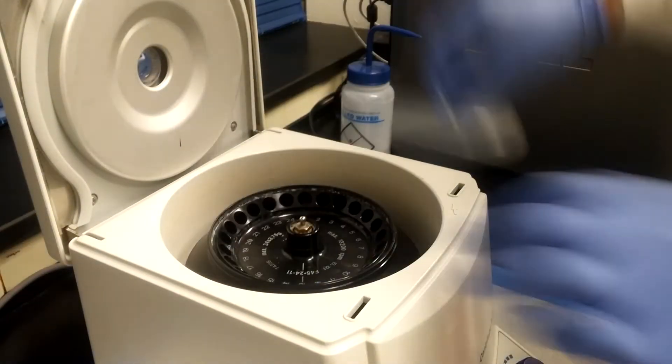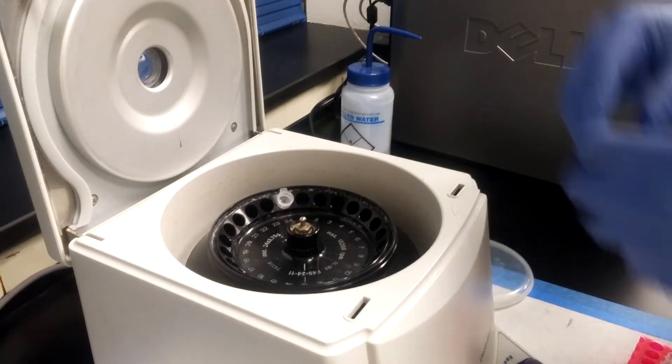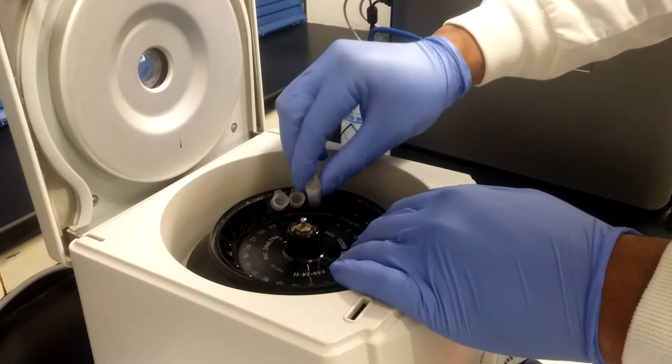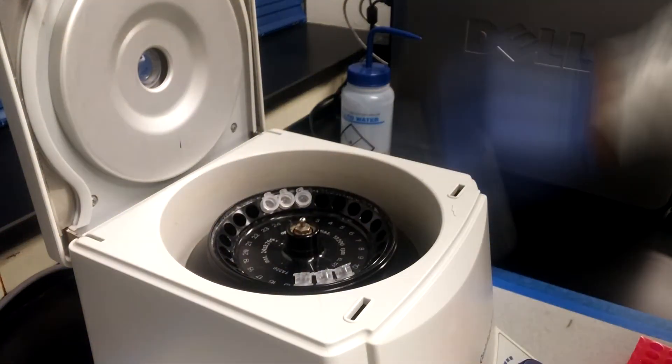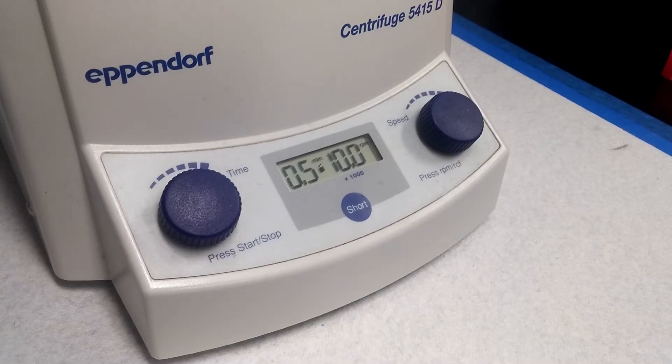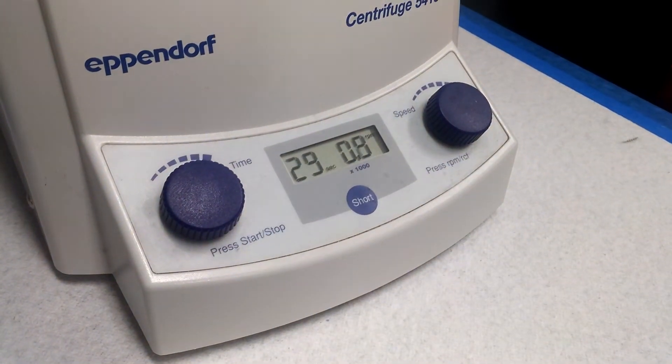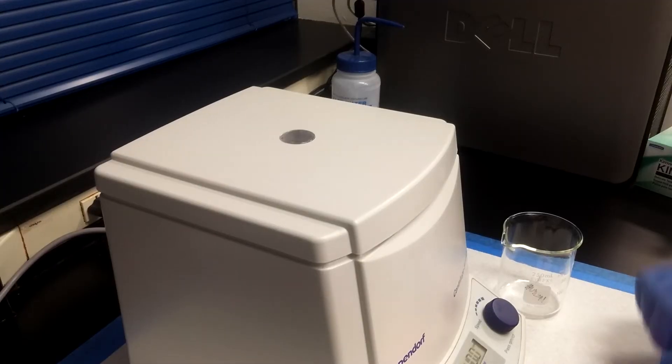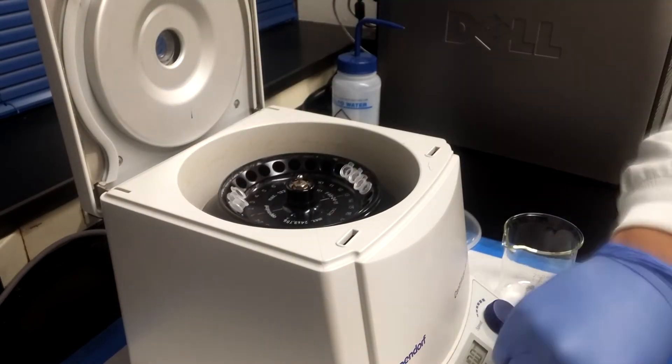The tubes are then placed into a centrifuge at 10,000 RPM for 30 seconds. After centrifuging, the buffer present in the collection column of each tube is discarded into liquid waste.